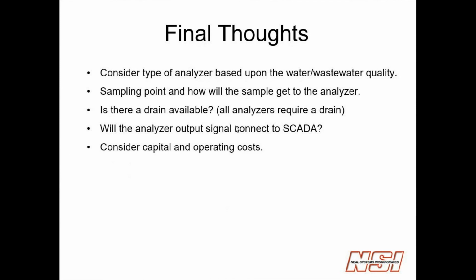Consider the capital and operating costs, obviously, and consider a pilot or trial. I would highly recommend doing a trial study, especially if you're using an analyzer for wastewater. Wastewater, especially industrial, that has any industrial feed, can have an effect on the amperometric analyzer.